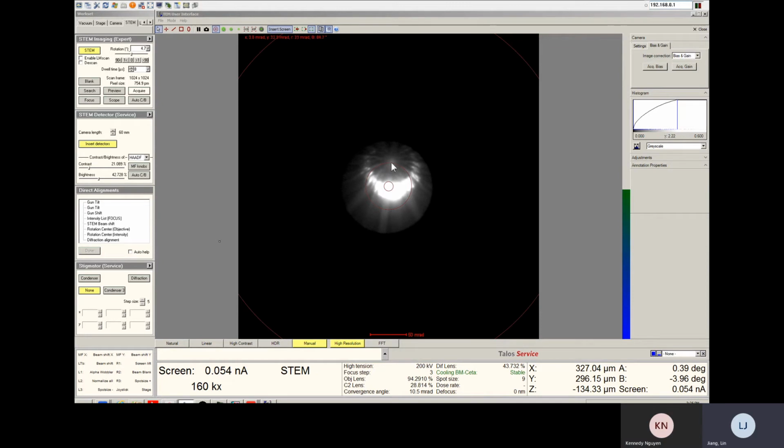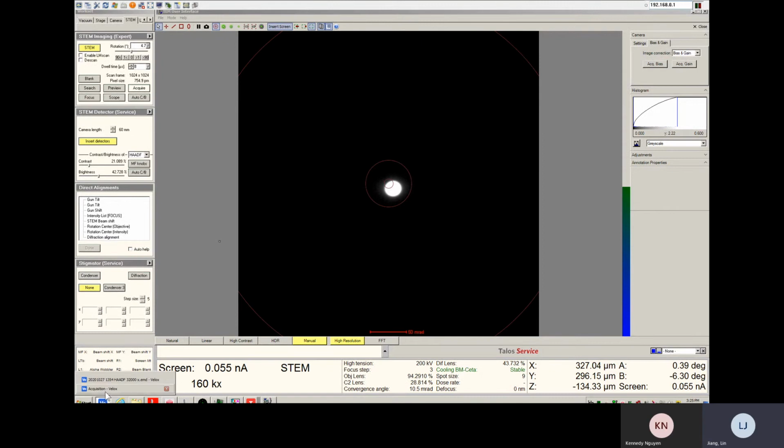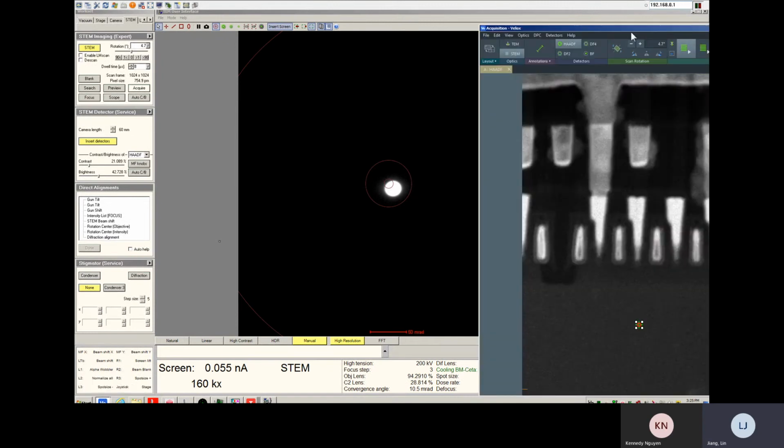Right now you have beta at negative 3.9. Based on that distance, you probably go to negative 6, and you go to negative 6 directly. You don't care about your sample moving. Go to negative 6 first, and then you can find the view and move your sample to the center again.